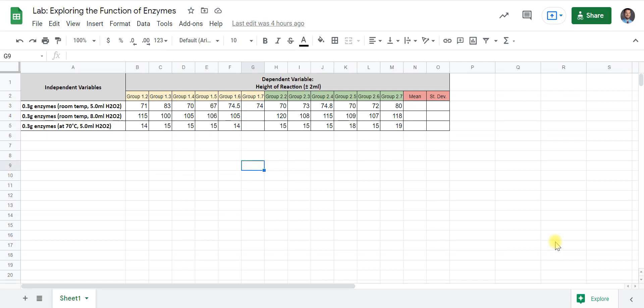Hey, hello IB Biology, this is Mr. McGee. This is for our lab we did on exploring the function of enzymes. Today we're going to make a graph and a table, and we're going to do statistical analysis and I'll show you how to set up your experiment. I'm going to do this really quickly because a lot of you can just skip ahead right to the steps you want, so you can always rewind and go back to the part that you need. I'll speak fast, so just bear with me.